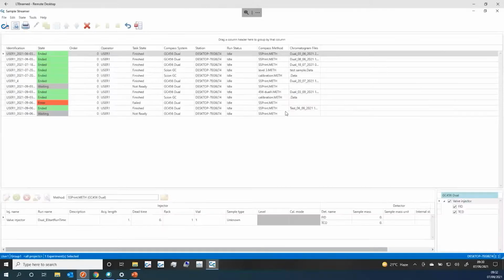So you can see that I have a few samples that have been run before. It keeps a note of everything that has gone through with it. My mouse is moving very slowly. Sorry, John, can you just repeat that last section? We lost your sound. Right, okay, everything was going a bit slowly in here, so I assume the network was being a little bit difficult.